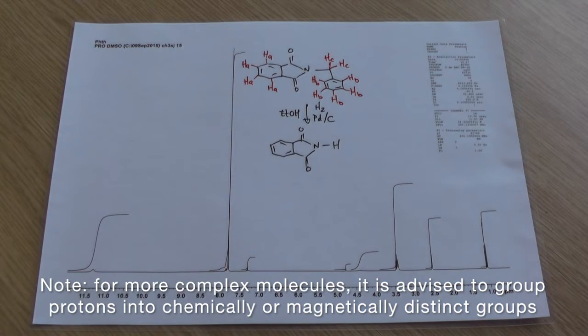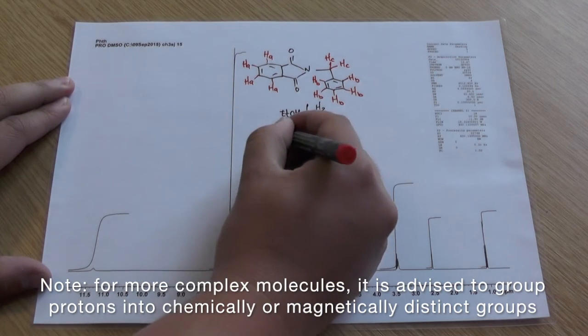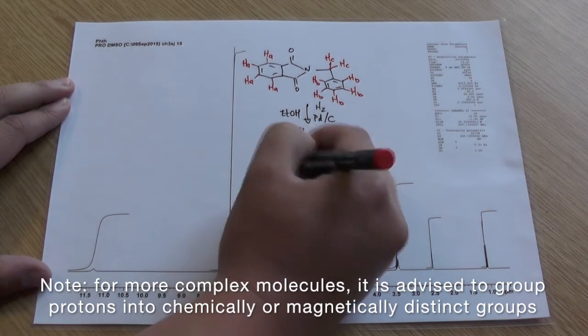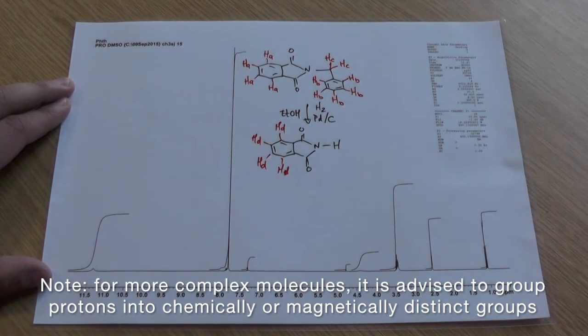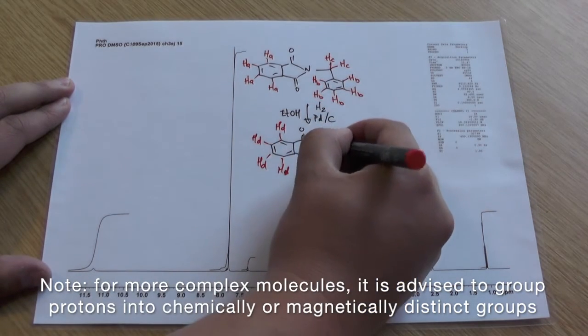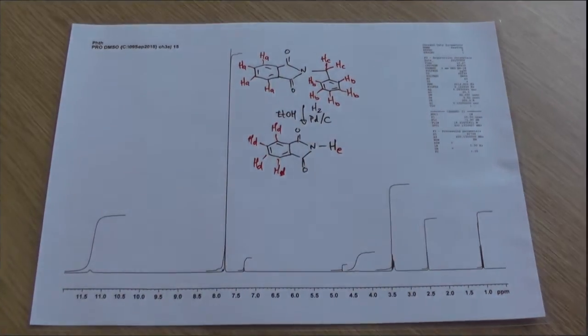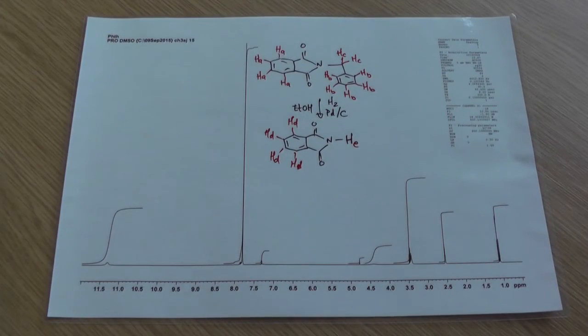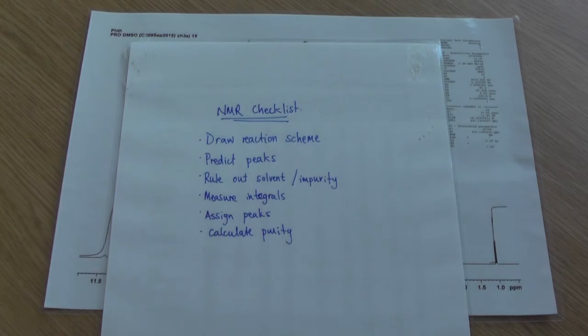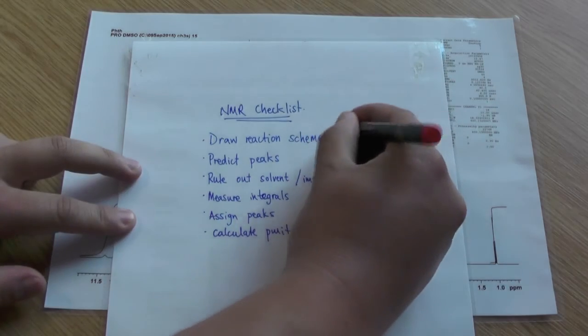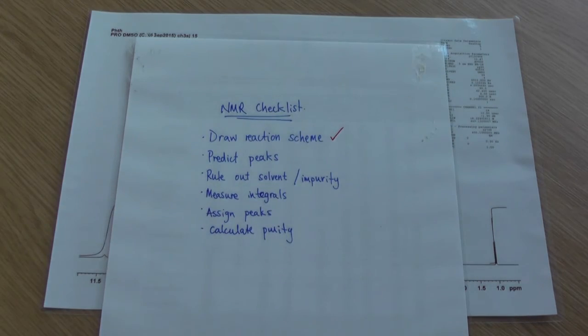And then in the product you've got your four aromatic protons and the hydrogen attached to the nitrogen of the ring. Looking back at our checklist, we've drawn the reaction scheme and we've predicted what peaks we might want to see. The next step is to rule out any solvent or impurity peaks.